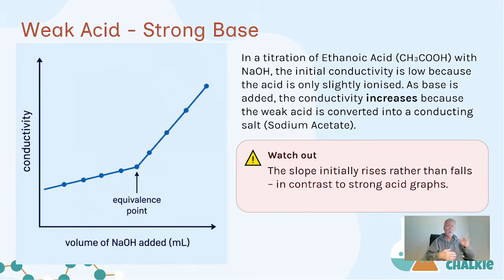up as increased conductivity. So unlike the strong acid, where hydrogen ions were replaced by sodium ions which weren't as good for conducting purposes, this time the sodium ion is what is allowing conduction to take place. That will continue again until the equivalence point.